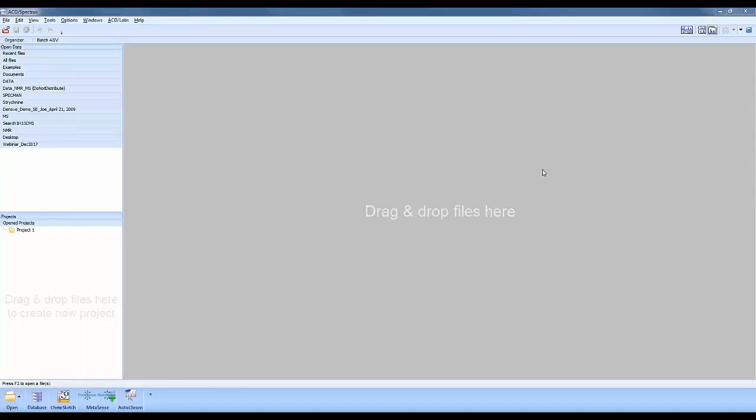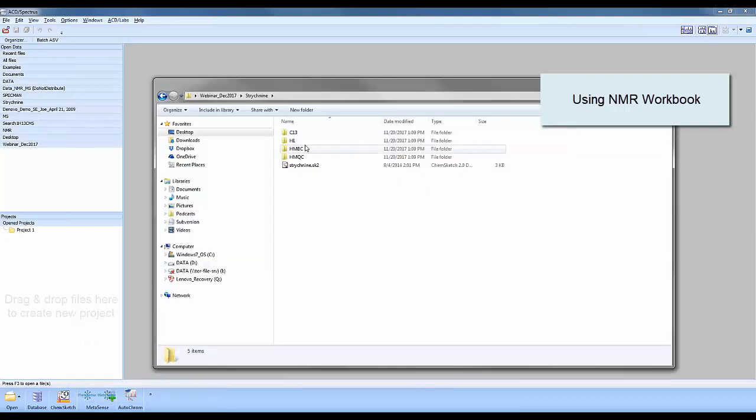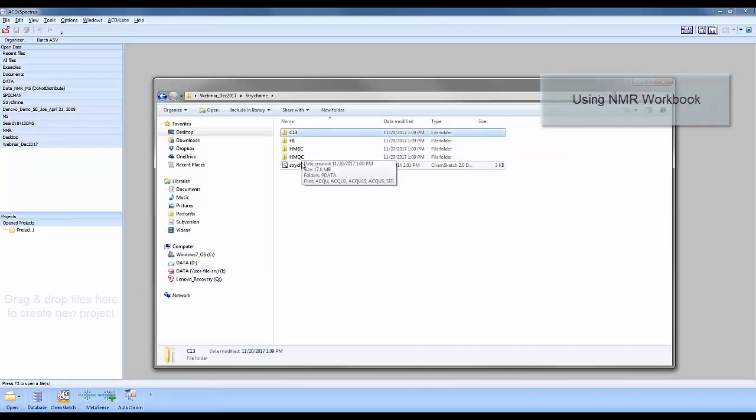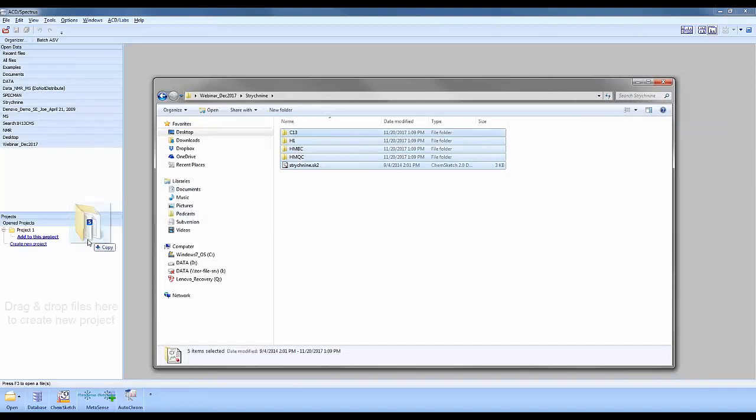I'm in Spectrus Processor, where you load your data. I'm going to select my experiments here - I have four experiments and a structure. I'm going to select it from File Explorer and drag and drop it into the projects panel.